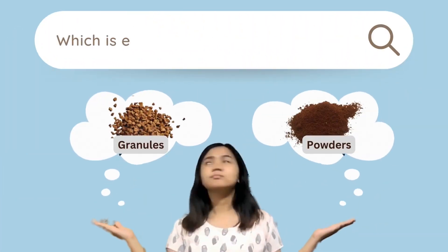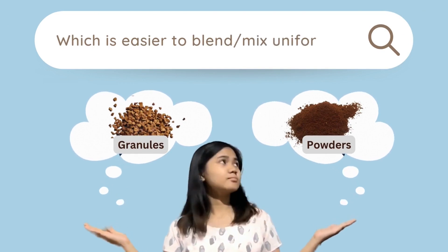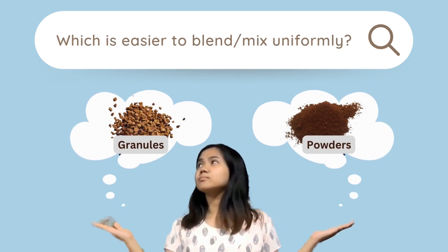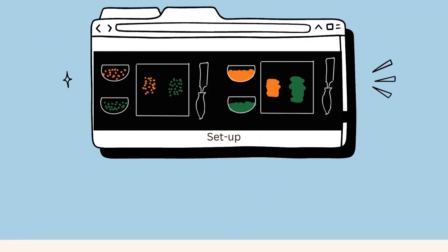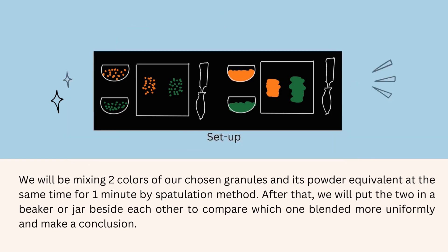We will be answering the question: granules versus powders — which is easier to blend or mix uniformly through a simple experiment. We will be mixing two colors of our chosen granules and its powder equivalent at the same time for one minute by spatulation method. After that, we will put the two in a beaker or jar beside each other to compare which one blended more uniformly and make a conclusion.